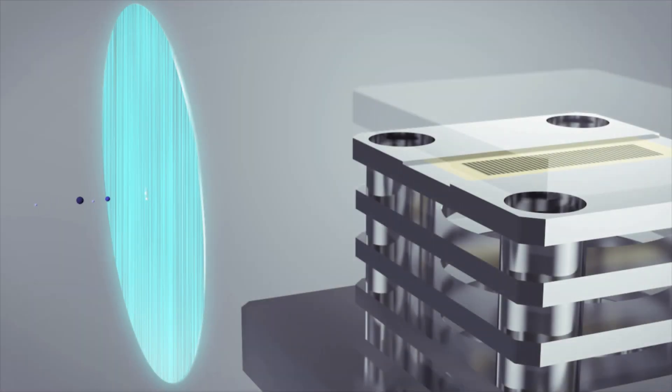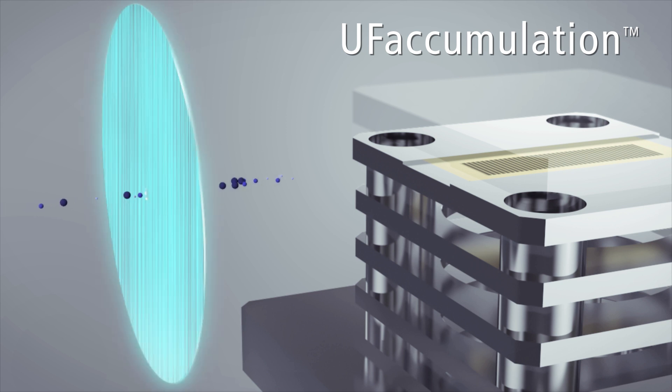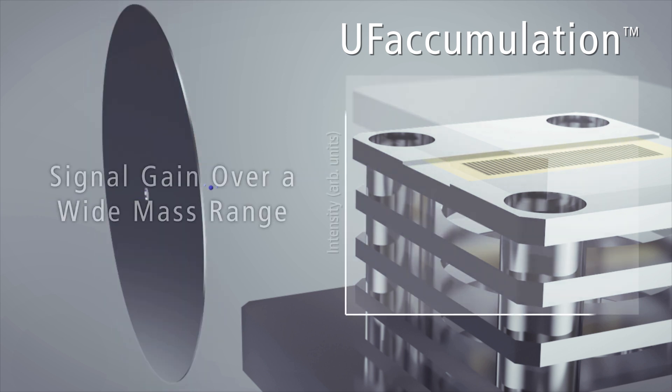Synchronization of ion transfer by UF accumulation helps prevent loss of ions over a wide mass range for increased sensitivity.